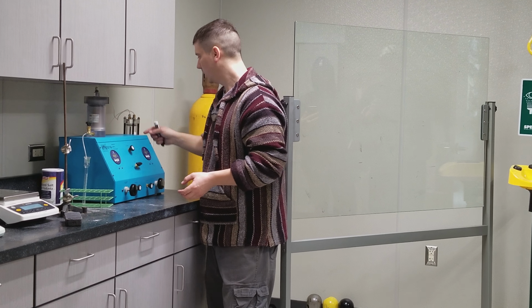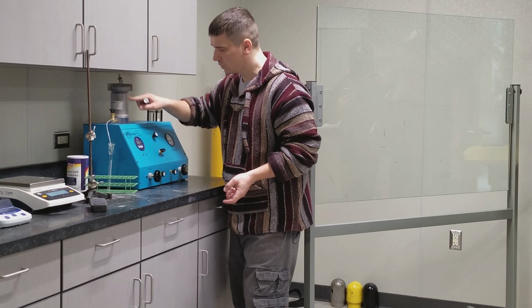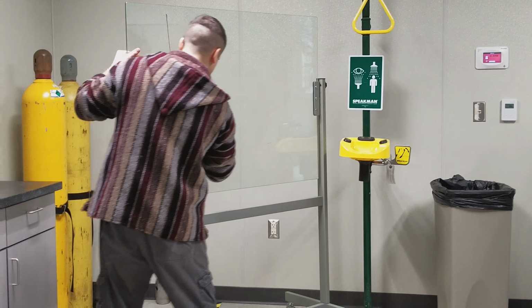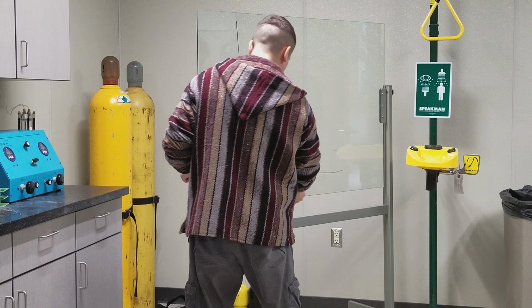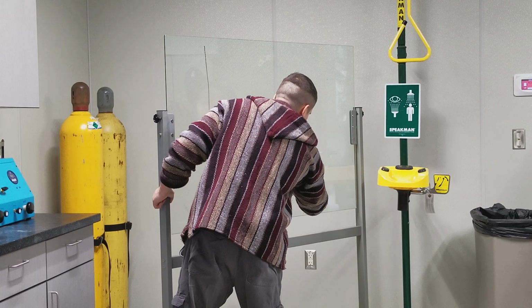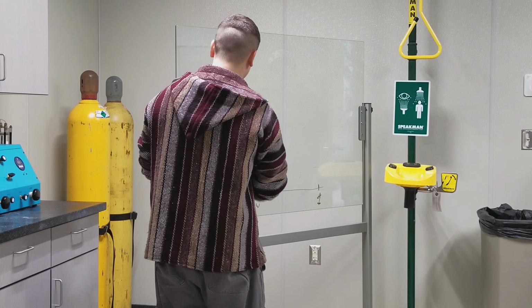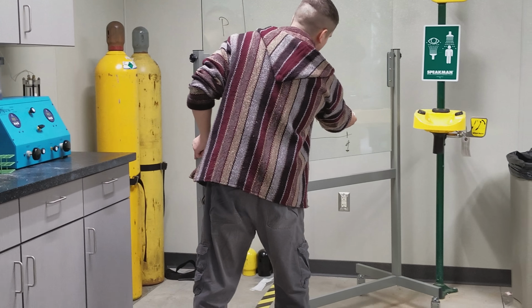You have a core holder. You have pressurized gas, air in this case, feeding into the core holder, and you're expelling liquid and collecting it here and measuring volume. Now, what are you going to be plotting in this experiment? You'll be gradually increasing pressure, okay? On the x-axis, you have water saturation, which in the beginning is equal to 1. You're going to saturate a core sample to 100% water saturation. And then you're going to start increasing pressure. Pressure will be on the y-axis. So the curve will look something like this.